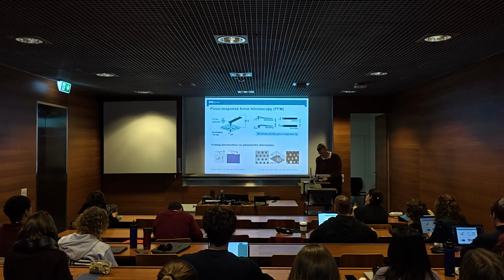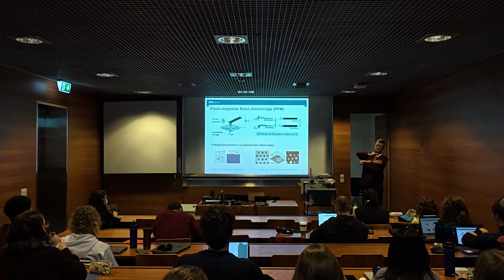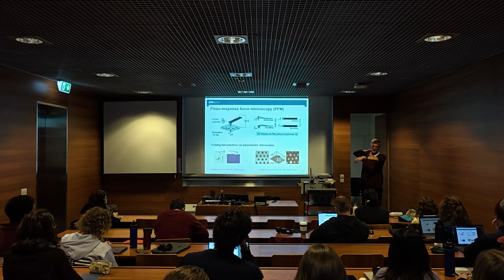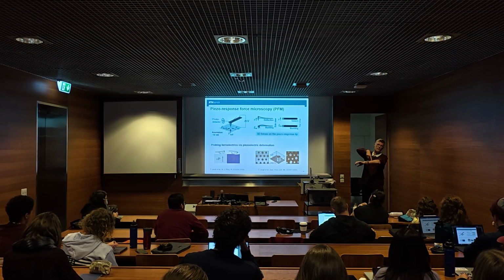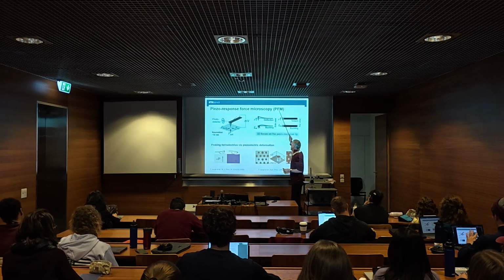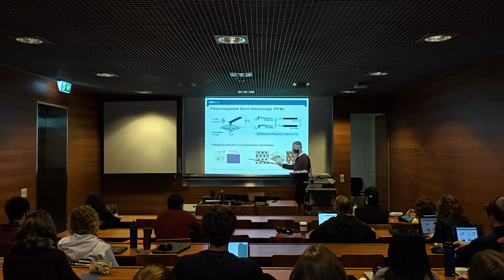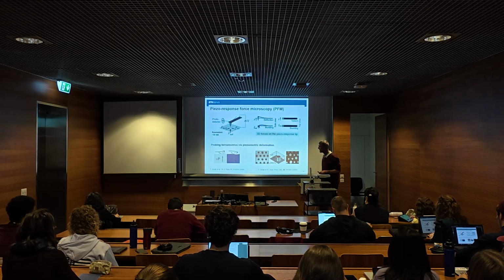So it's a little bit like this. First I apply the voltage, and that is what the surface does. And that bump that I created with my voltage is then what is measured in the atomic force microscopy mode. The other way around would be to poke into it. So it's atomic force microscopy based on the piezoelectric effect, so piezo response force microscopy, or in short, PFM. That's very useful to measure ferroelectric domain distributions, because remember, ferroelectrics are all piezoelectric.